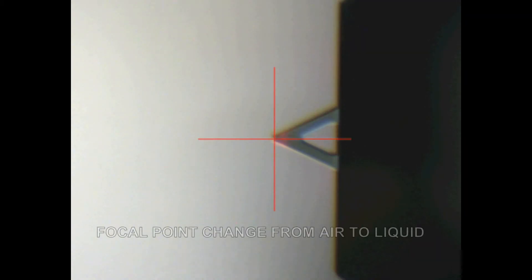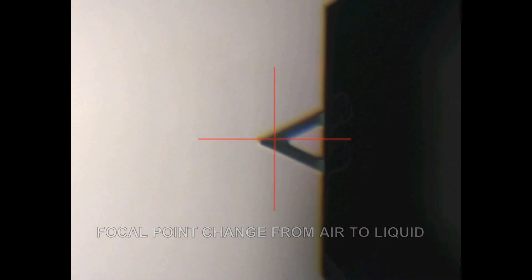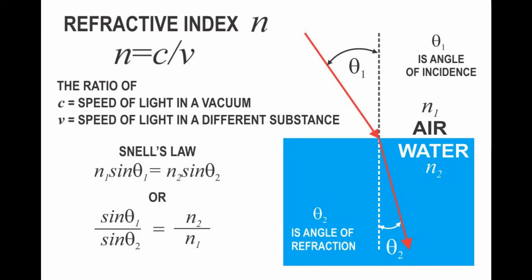The apparent position of the probe and the path of the laser will be altered by the phase change from an air to liquid environment. This phenomenon is a result of the change in refractive index, which is defined as the ratio of the speed of light in a vacuum to the speed of light in a different medium.